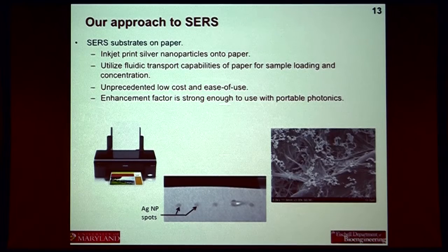Do you have an increased diffusion because of the characteristics of the paper? So we haven't found a pore size that is so large that the nanoparticles move through the pores very much. Maybe to a very small degree, but not anything that's of significance to us. Ultimately, as you'll see when we show how we do our sensing, the movement of the nanoparticles wouldn't cause a problem in a lot of the things that we actually do.